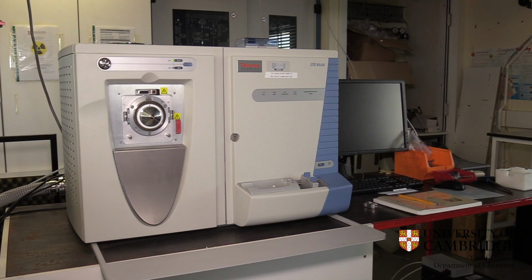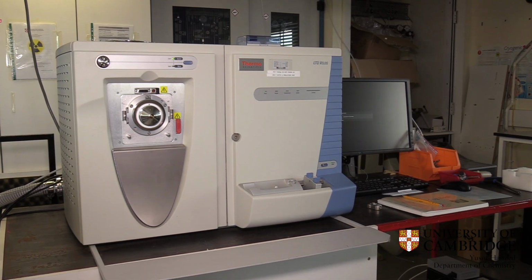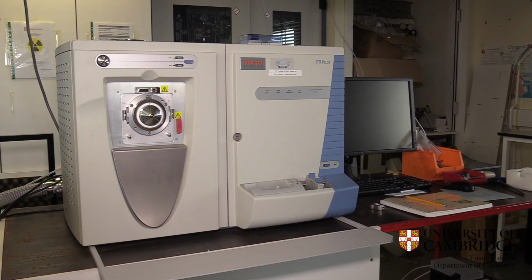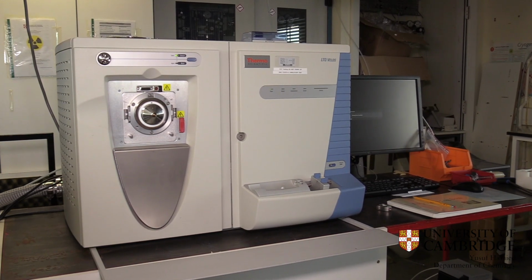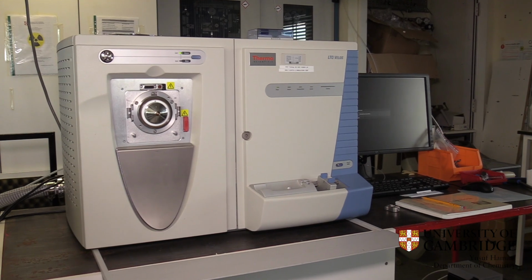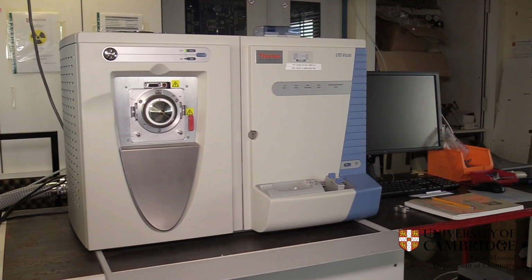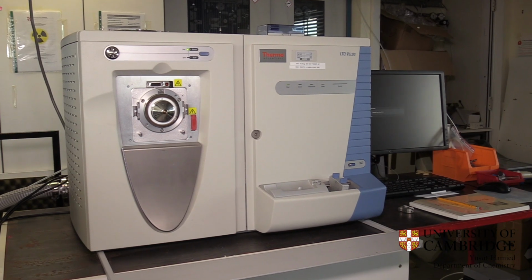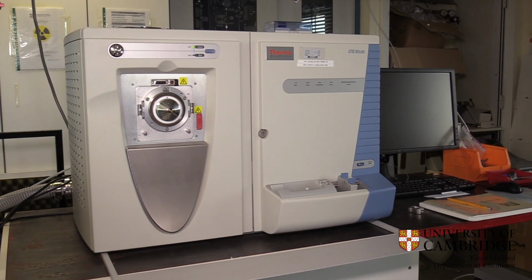This is the second mass spectrometer that we have in the lab. This is just a less fancy version of the Orbitrap that you have seen previously. And this instrument works in low resolution, so it's not particularly good for differentiating between the mass of molecules that are very similar to each other. But nevertheless, it's really useful to have a second mass spectrometer, and we mainly use it for instrumental development.